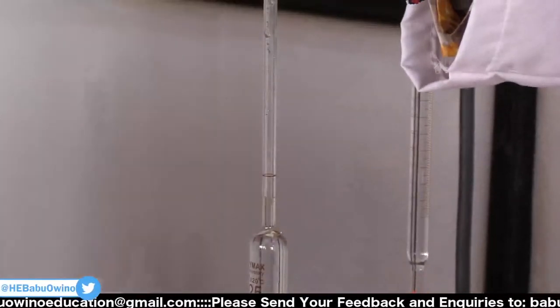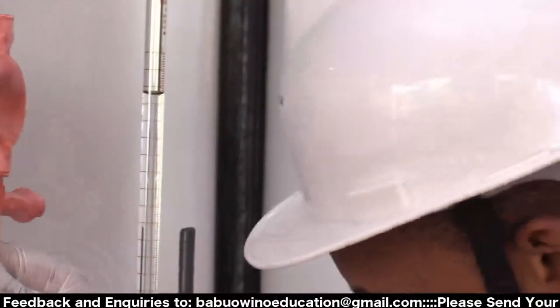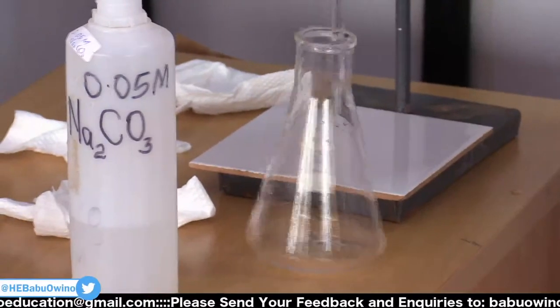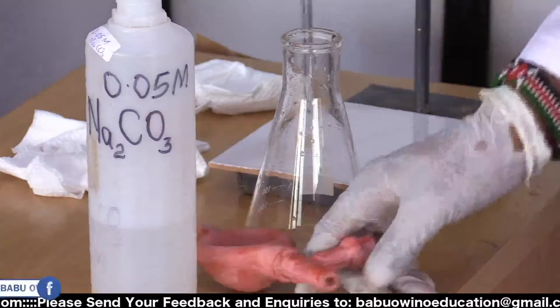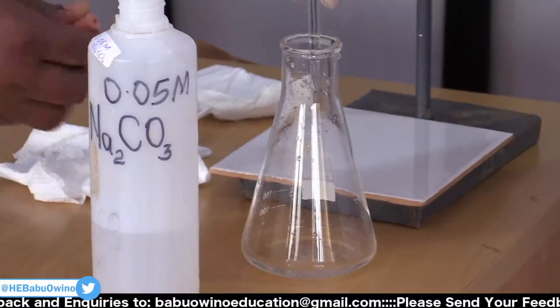This should take you at least just a minute. Then after that, you release it up to where the mark is. Good. So release it inside the conical flask. Or if you want it to go faster, you remove the pipette sucker so that the atmospheric pressure can act on it. The pipette filler.